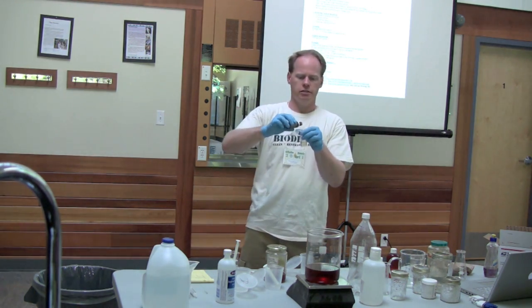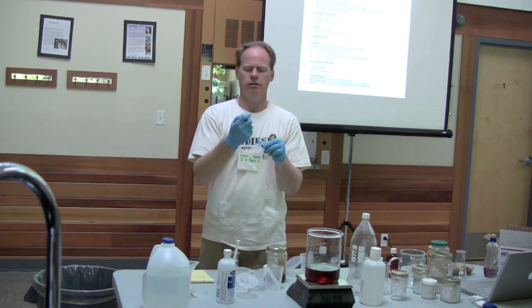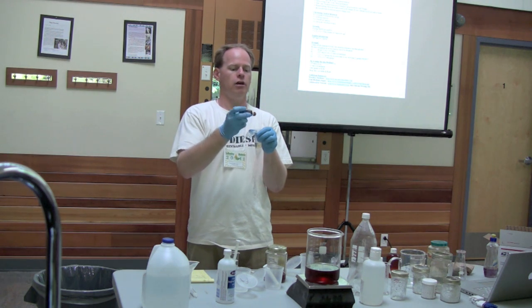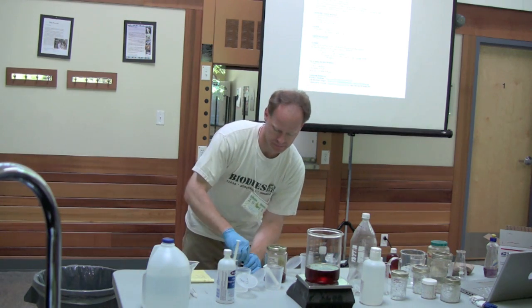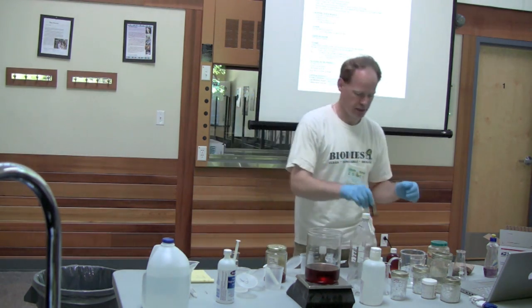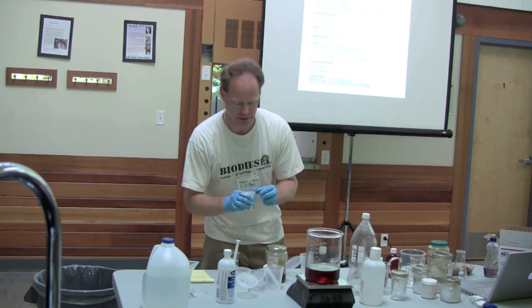So this is our titration solution. I'll just go in here. No, don't take it off. It's designed to drop. Oh, okay. Yeah. Oh, there we go. Okay. I can't bring stuff like this across the border, so they all have to supply it. So I apologize if I don't look like I quite know how to use theirs.